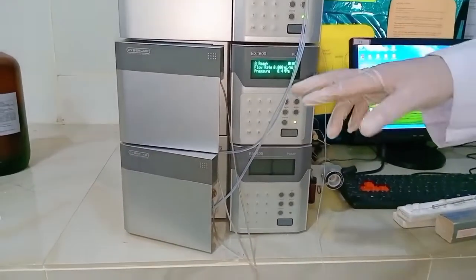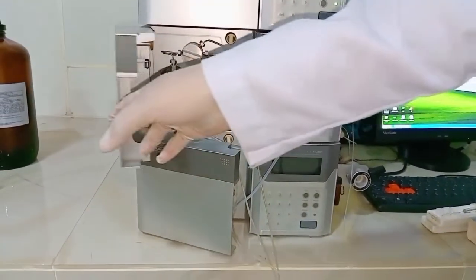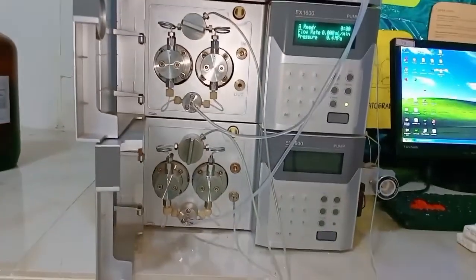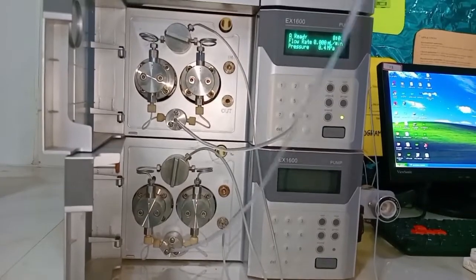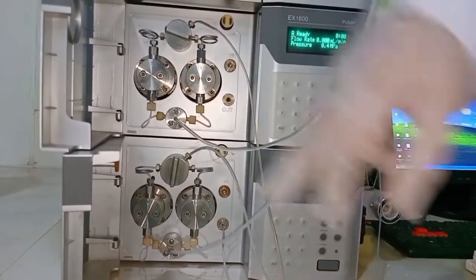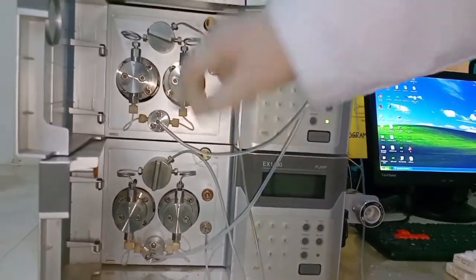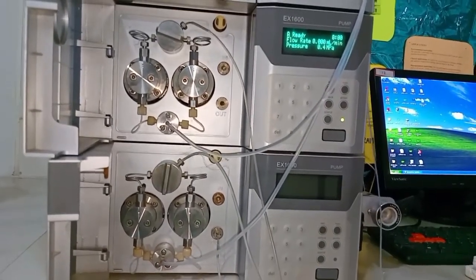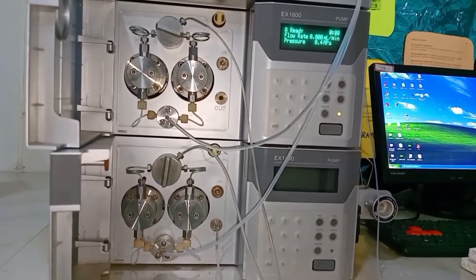The second component of the HPLC is the pumps. These are the pumps in the HPLC equipment. They deliver the mobile phase into the column. The pumps can withstand high pressure of 6000 to 9000, and the pumps are of two types, isocratic and gradient mode.